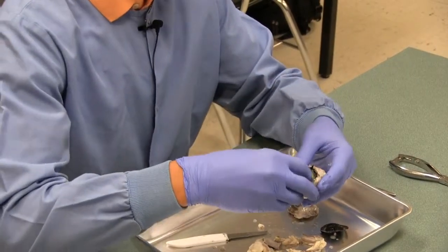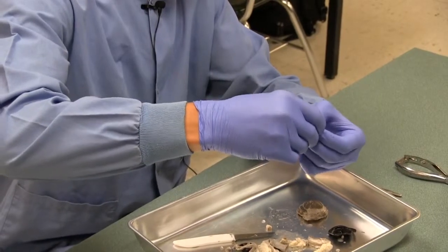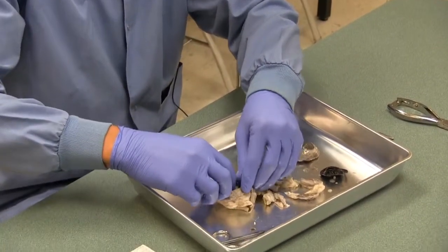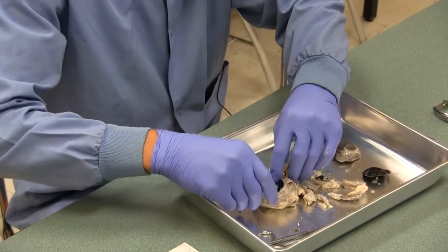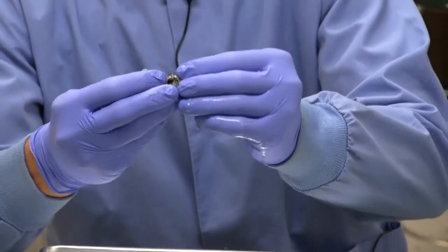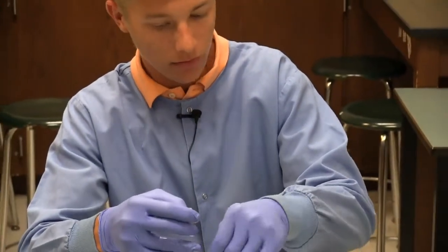Now, inside the eye socket, we're going to start by looking at the lens. This gelatin-like substance is a mixture of protein and water. We call this the vitreous humor. I'm going to remove this and take the rest of that out. This serves to refract light into the eye as well — it's clear. Now, this little marble shape is the lens. What this does is it concentrates and magnifies the light into the retina.